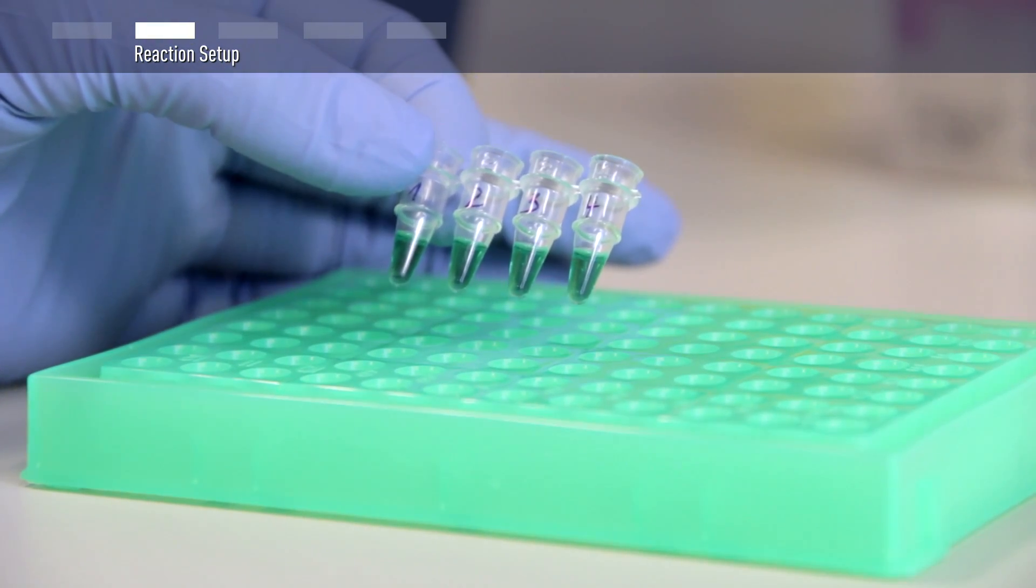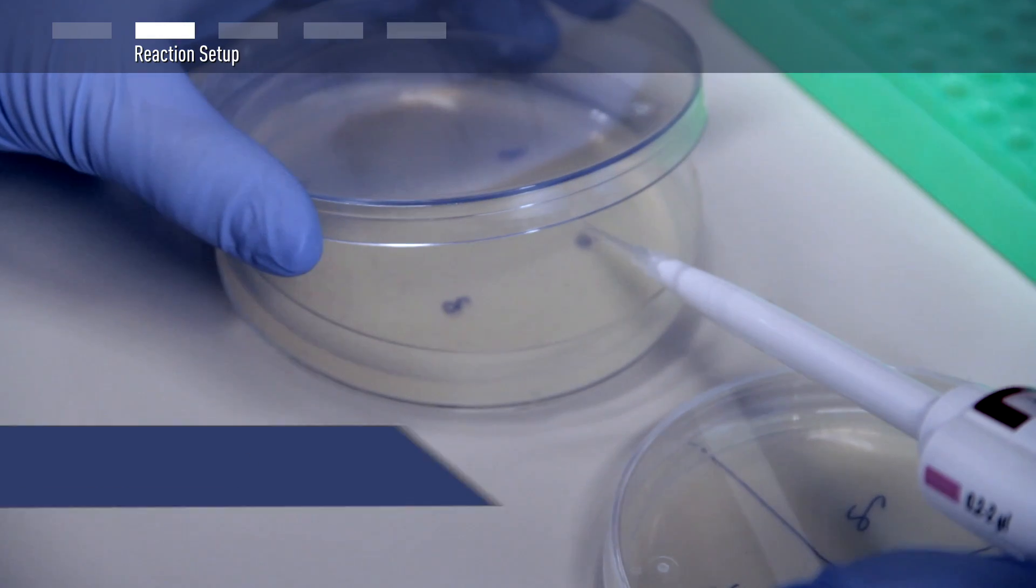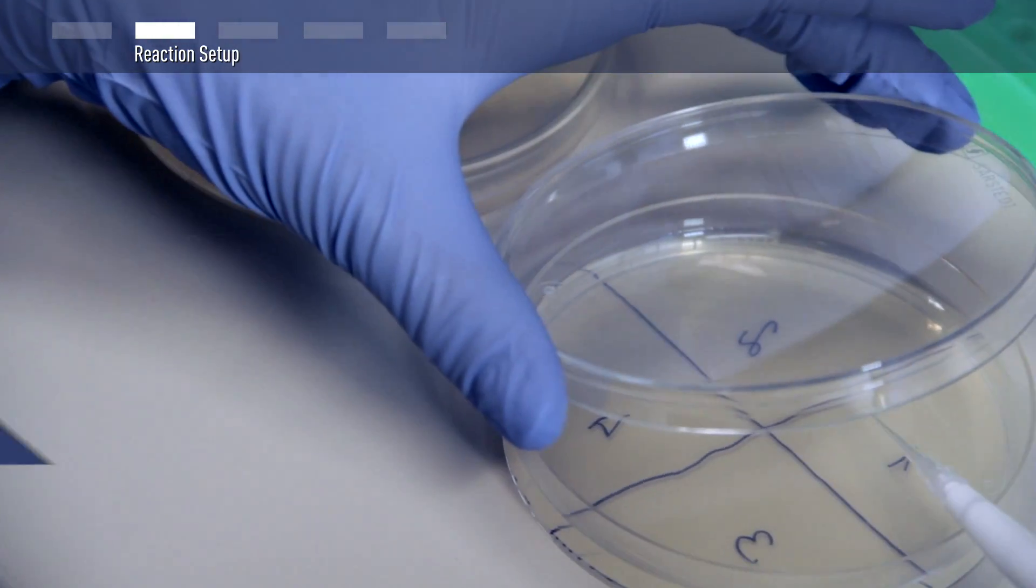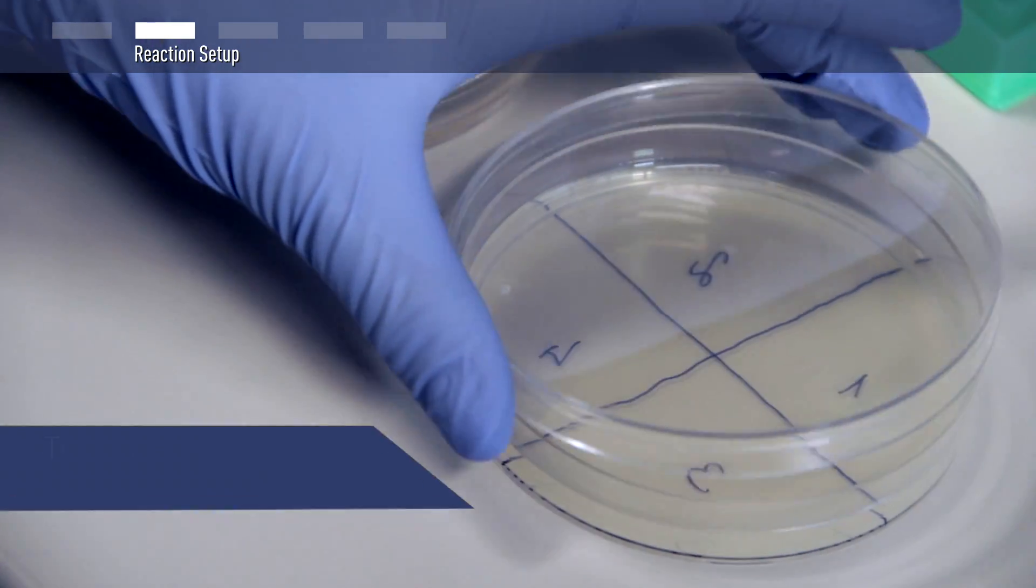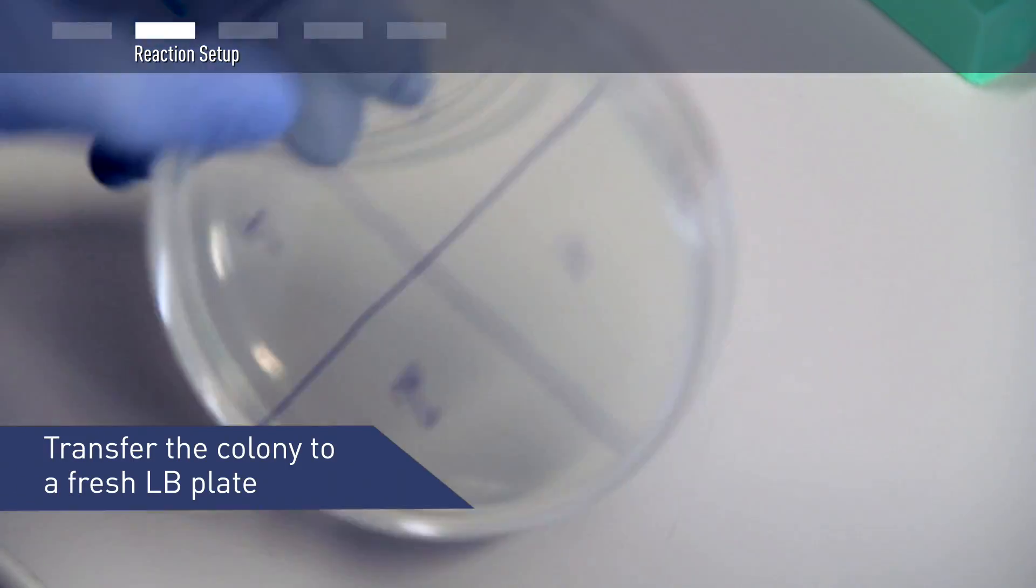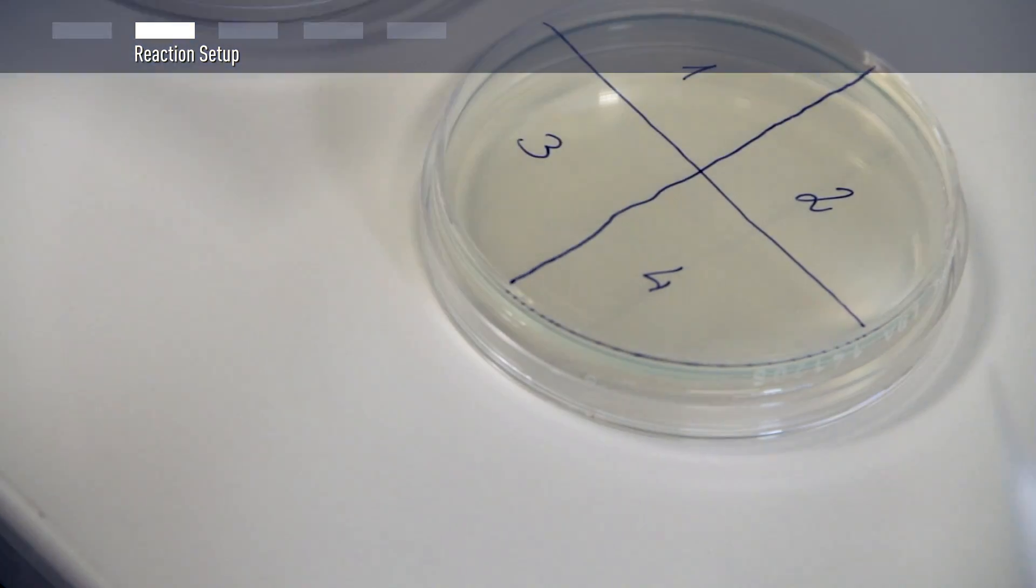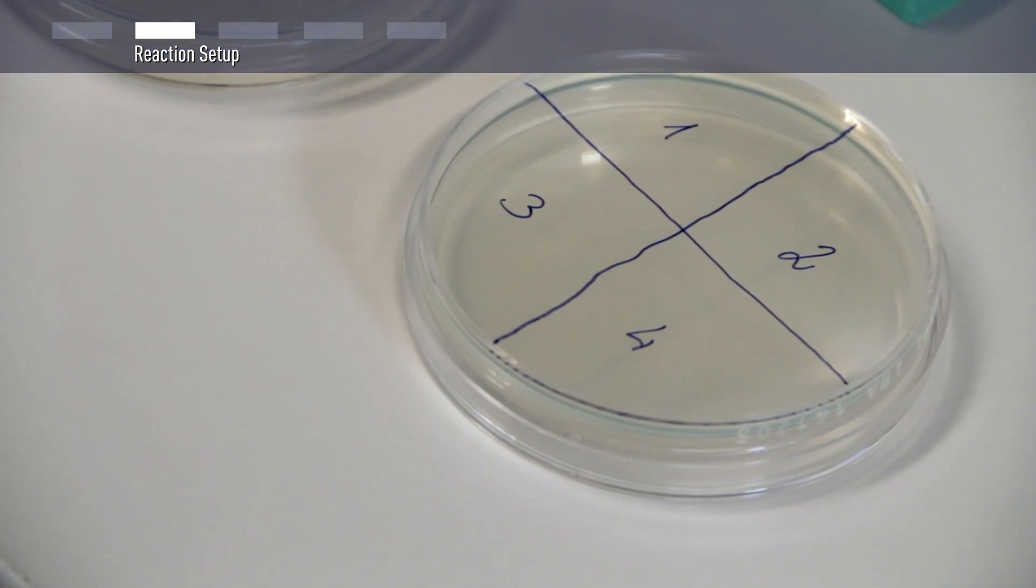To perform Colony PCR, swipe a well-isolated bacterial colony with a sterile pipette tip. To make a replicate of the colony, transfer it to a fresh LB plate with the tip. Make sure to properly label the LB plate so that the position of each colony can be easily identified.